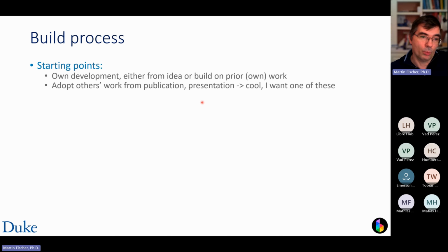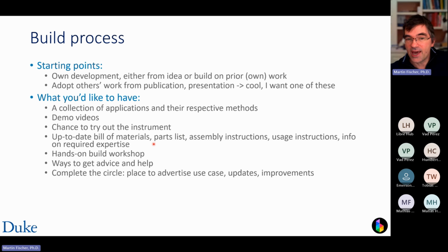All right. So what are the steps? What would you like to have to build one of those? Ideally, you want to know what this device is capable of doing. So you want to have a collection of applications. What can this device do? Preferably a little demo video. Ideally, you'd like to try this instrument, maybe travel to the site and bring your sample and see whether this actually does what you think it does.